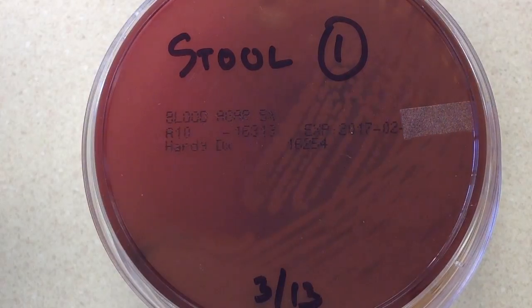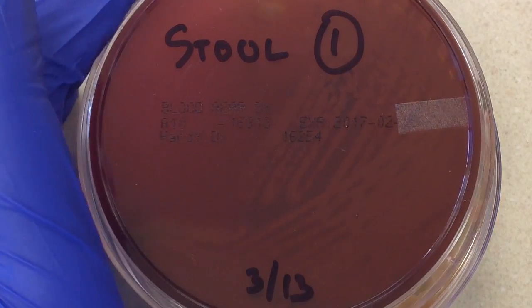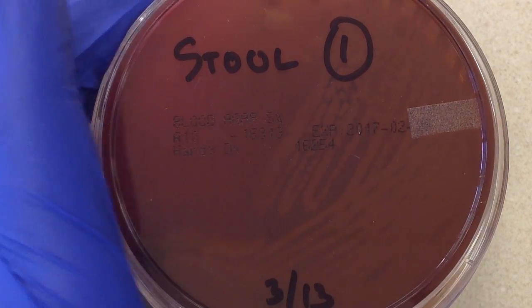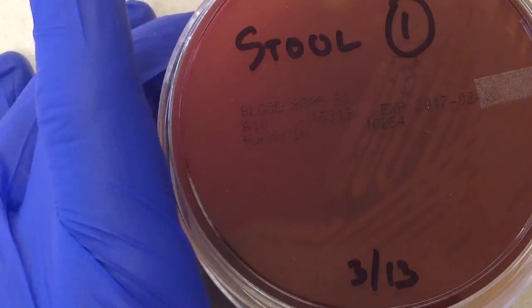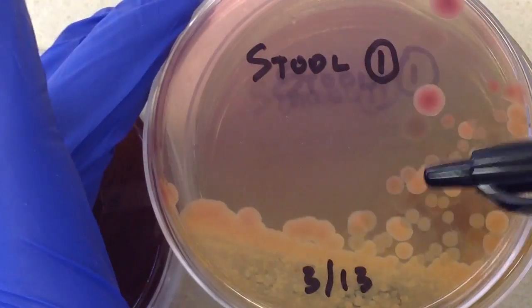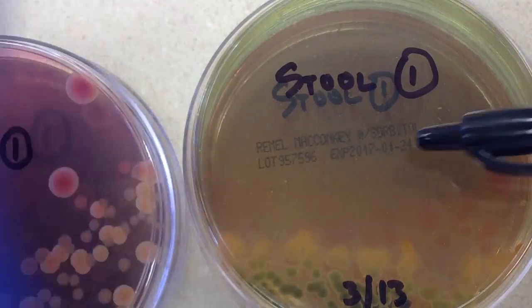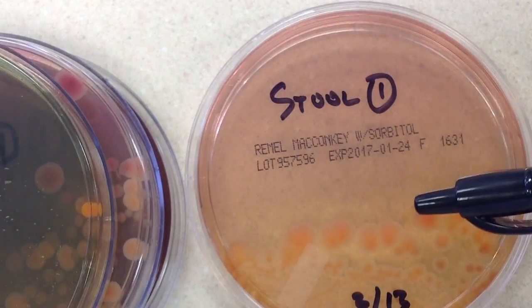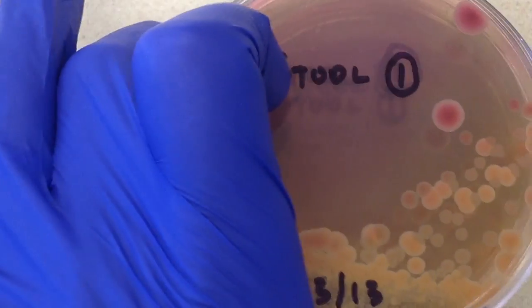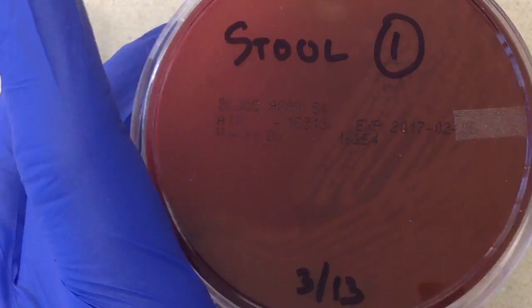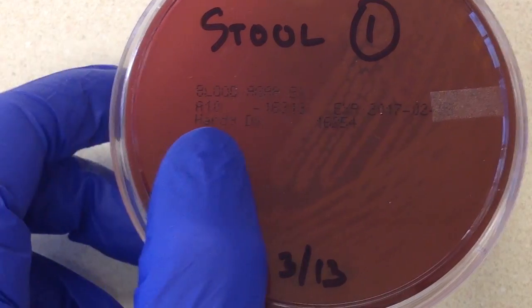I always insist that my students understand the media they're using, what it's made out of, and what its function is. Sheep blood is a supportive differential. McConkey's is selective differential. Hectone enteric is selective differential. McConkey's with sorbitol is also selective and differential. These different qualities give us a lot of information and help us in the workup of organisms or mainly pathogens.